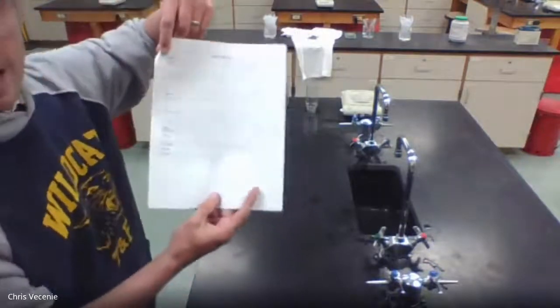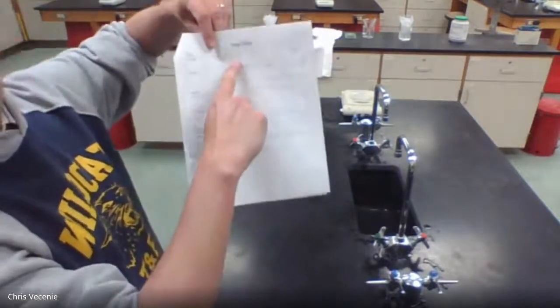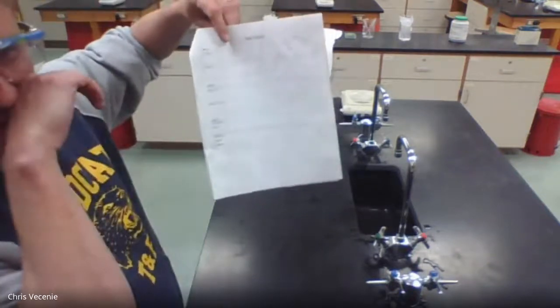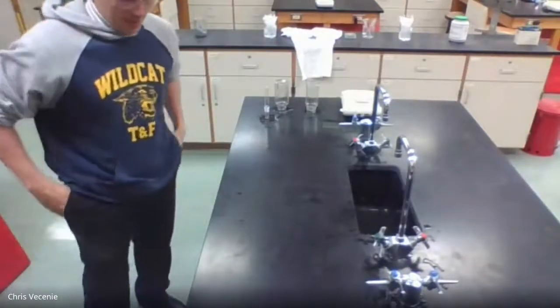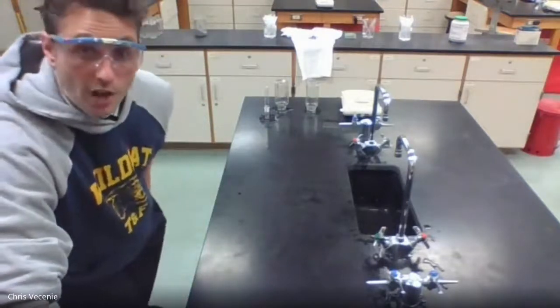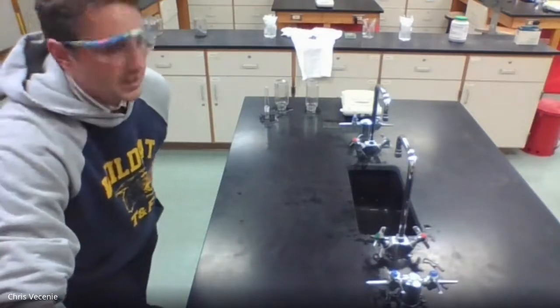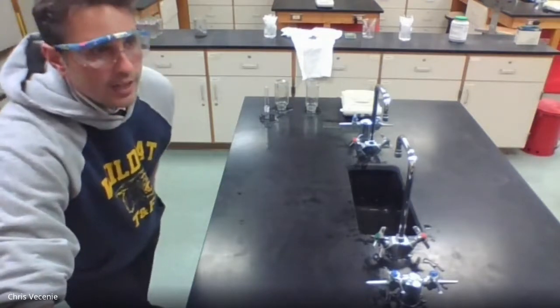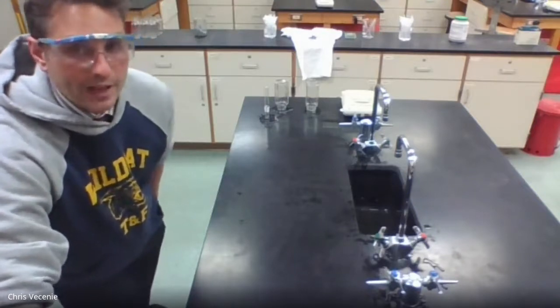All right, so for our first test, we're going to test for fluidity. I'm going to test my test tube to hear or see if the hydrogen is there, and then wait 30 seconds and see if it's still there. Now, one of the main differences that we'll see between the hydrogen and the oxygen: oxygen facilitates fire. So a glowing splint or an on-fire splint stays burning or relights. Hydrogen, if it gets near a little bit of oxygen, is combustible.